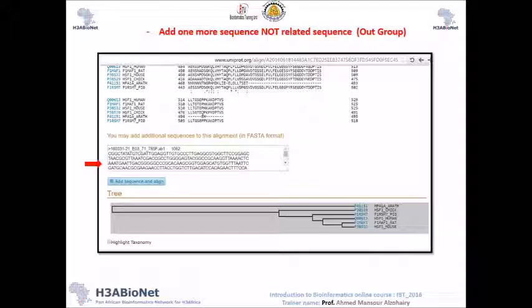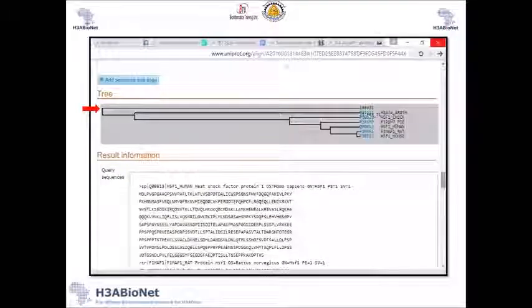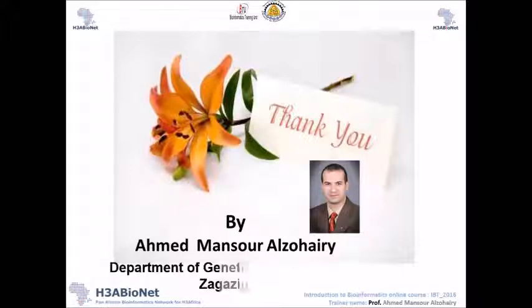So we'll keep this just as building the multiple sequence alignment, and keep the FASTA format files of your alignment and of your sequences on your desktops, so we can use them in the next practical. I hope this was simple and easy, and we will tackle different practicals in the next lectures.